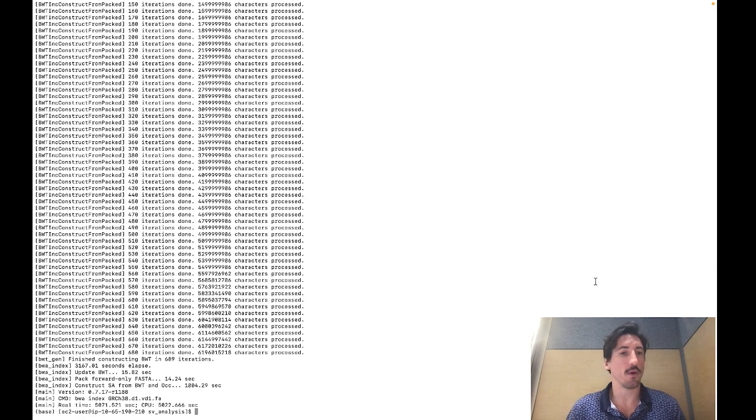Okay, so BWA finished its indexing for the GDC human reference genome. This took about an hour or so, a little bit over an hour. Because of this, my shell session timed out. So we're going to have to reload the SvABA build directory into my path, just so we can call on the SvABA command from anywhere in the instance.